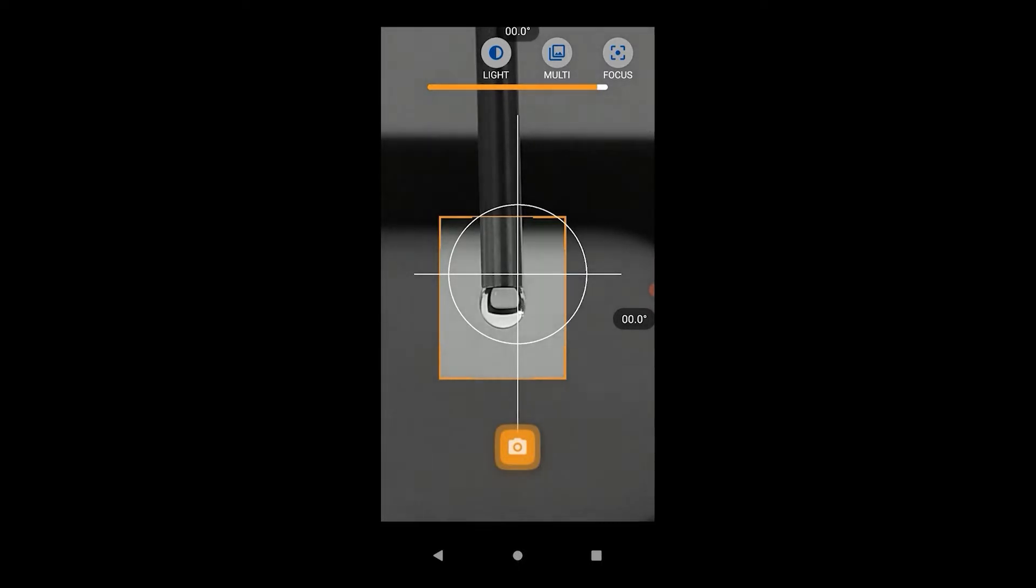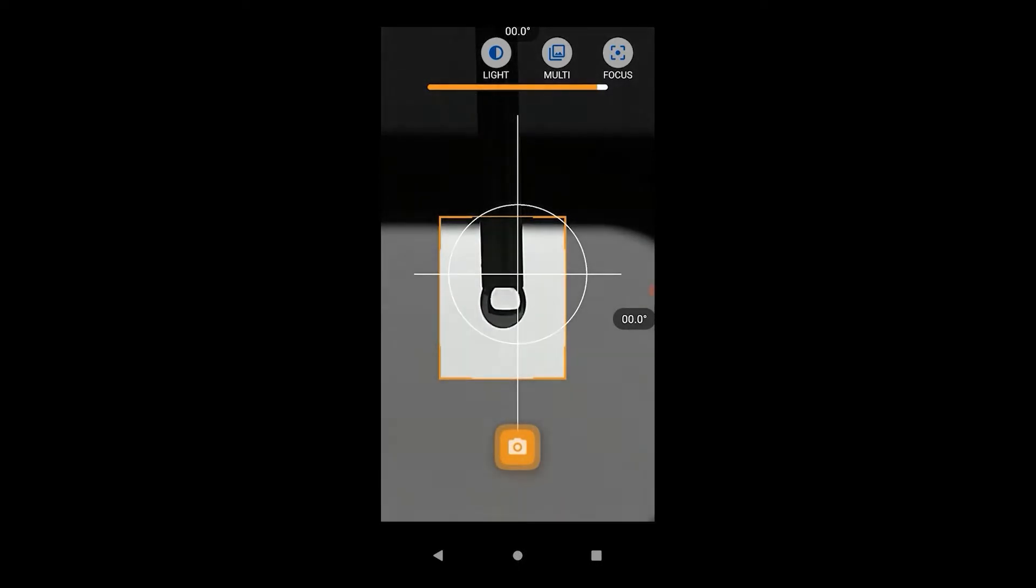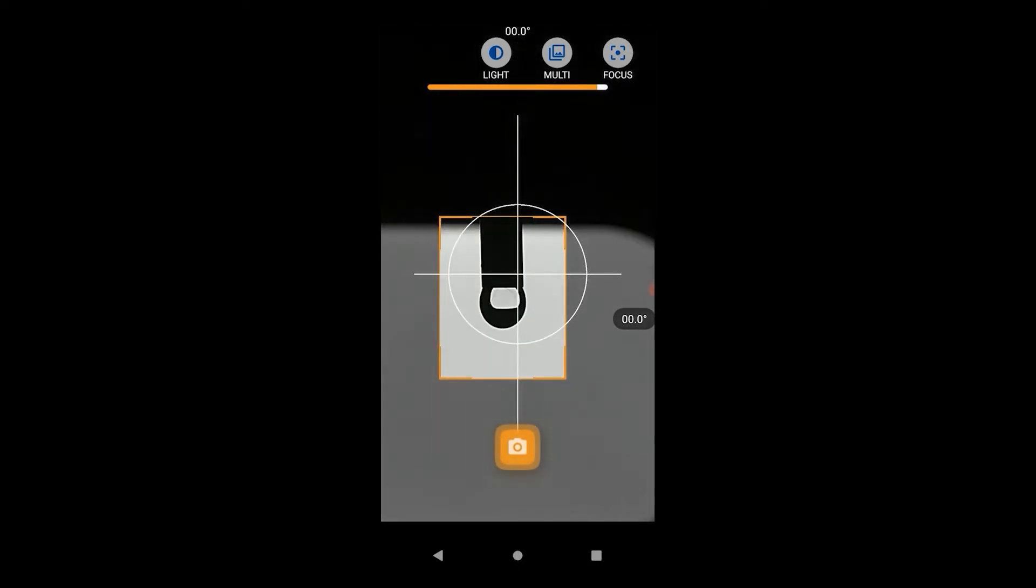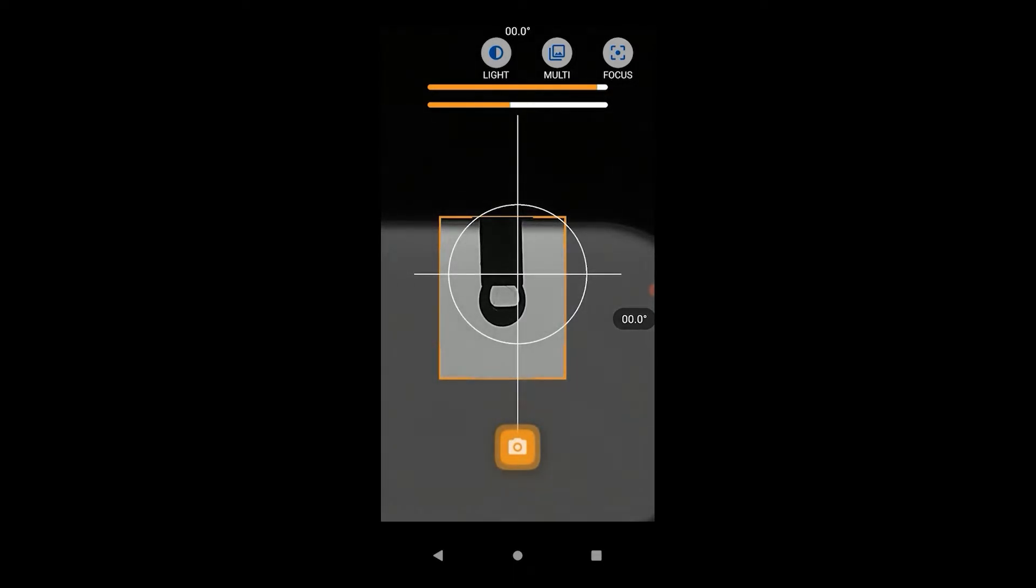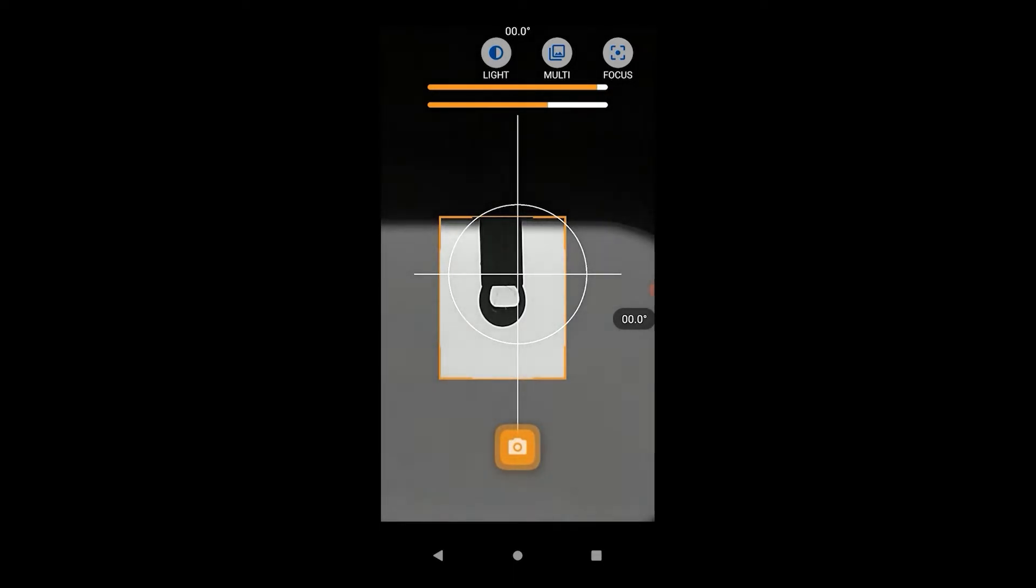The aim is to be as close to the droplet as possible without losing focus. Adjust the LED backlight and the phone's light to get the best possible contrast between the droplet and the background.